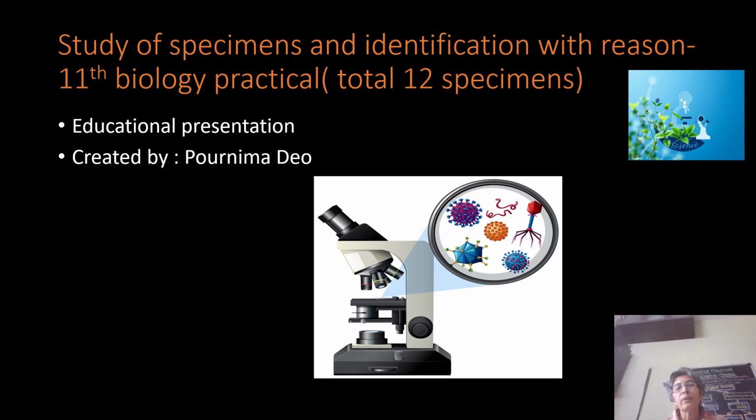This video is about the study of specimens and identification with reasons. You are provided with specimens or slides, and you have to identify the specimen and write the features. Okay.